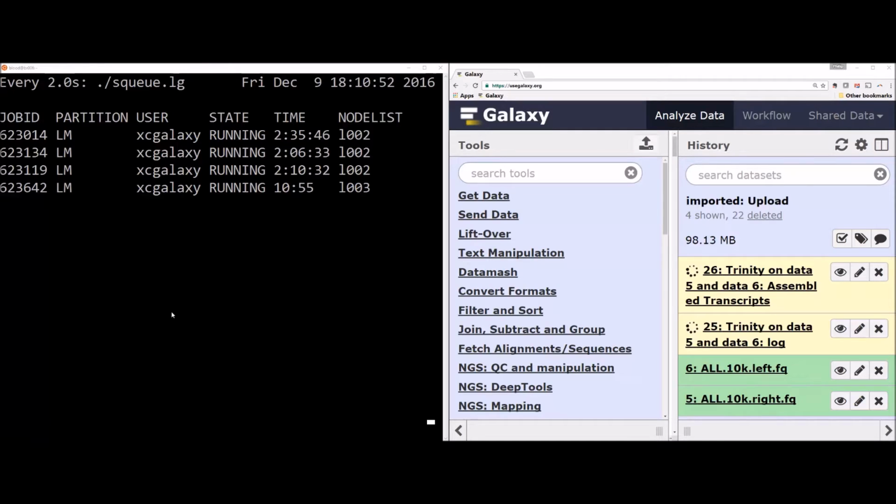It dropped out, so it's finishing up, and so Galaxy is going to process the data at PSC and the metadata and stage the results back to TACC. And so in a few more moments we'll have the output data all set up and ready here on Galaxy Main.